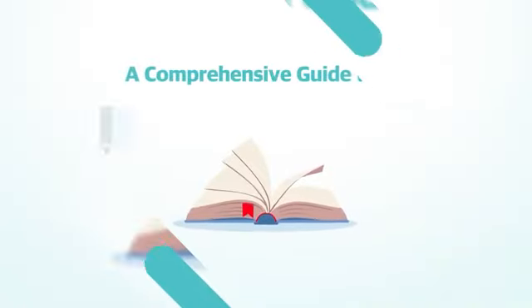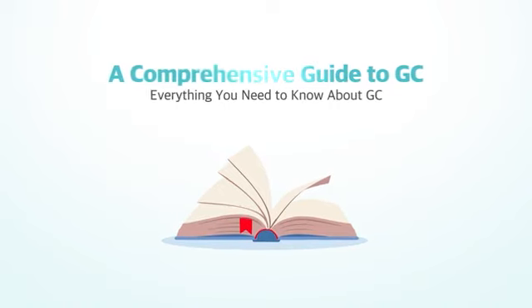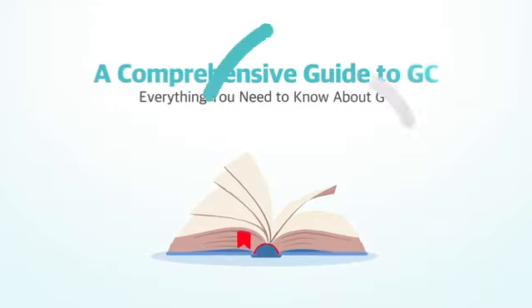A comprehensive guide to GC. Warning: this video includes everything you need to know about GC. Once you watch this video, you'll be dying to know the next series.